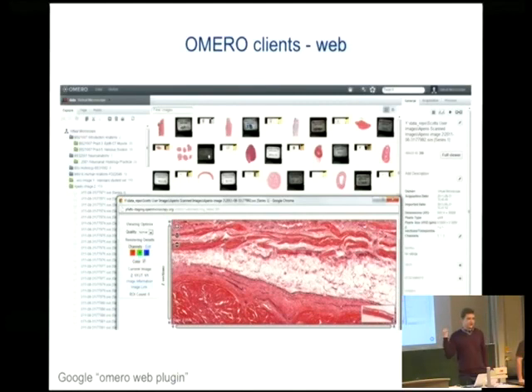This is based on Django, a Python web framework. On the client side, there is JavaScript to give users this kind of one-page application feeling. And it's also extensible. So again, the API is generated from the source by Slice. This is an ICE component. It is Python-based, so if someone wants to extend the Python code, by all means. Also, the JavaScript is available and annotated, so people can see the openness of the project. They can trust the algorithms that we use for image rendering and analysis.